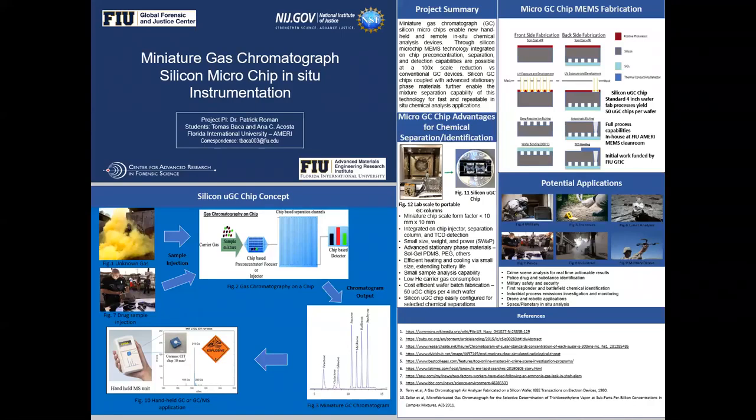If you want to input a solid or a liquid, you would probably use another device prior to turn it into gaseous form and then run it through the GC with an injector. So there would have to be an extraction step or sample prep if you had a physical substance. But sampling the air around a substance, this device can do that. You'd be able to. The way that we're designing it is for injection, but it is possible to make it so it can analyze ambient gases.